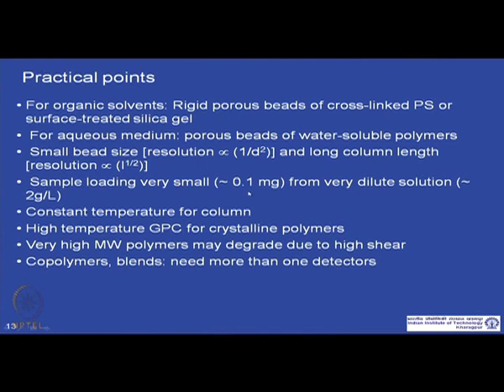Obviously, the sample loading is very small from a very dilute solution, especially when you are using detectors like light scattering and viscosity. There our assumption is the solution is very dilute, so that we can consider the specific viscosity divided by C as an intrinsic viscosity, and the molecular weight obtained by light scattering. So, there will be less error.